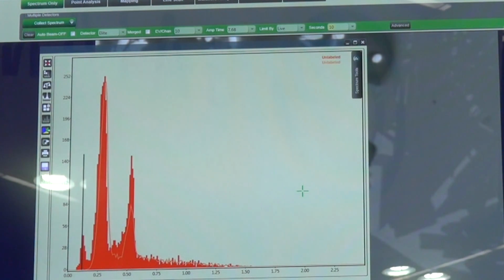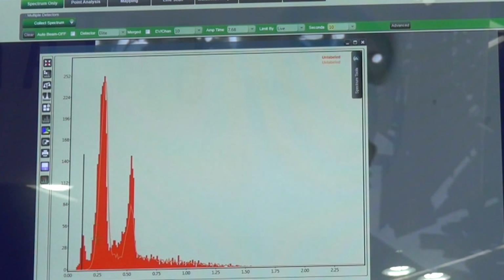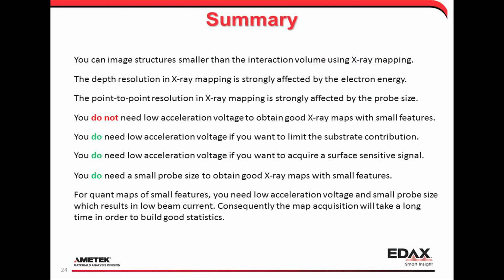Another point why I wouldn't want to leave the beam burning at the same spot for half an hour and try to do this again in this microscope. If your vacuum is dirty, you're going to build carbon on top, you'll lose your signal after a while because you simply have more attenuation. You're building up a carbon film in there. I've been waiting a while to get my hands on one of these detectors for real on my own microscope at home, so I can start looking a little more at the L lines, because with the polymer windows, you have no chance of mapping silicon in this range.